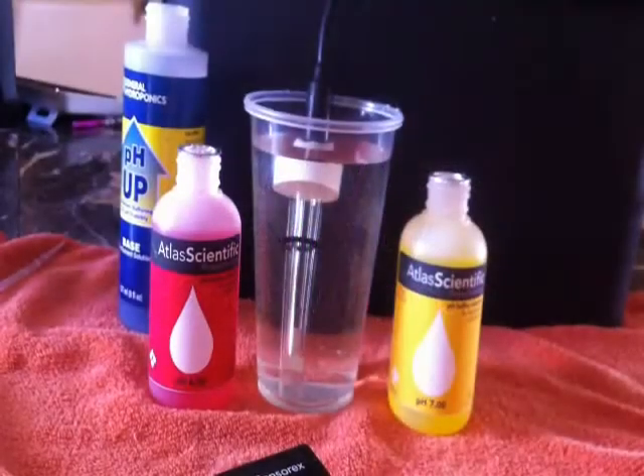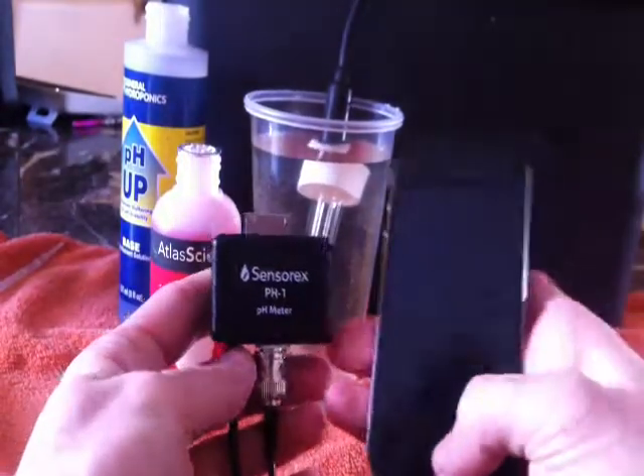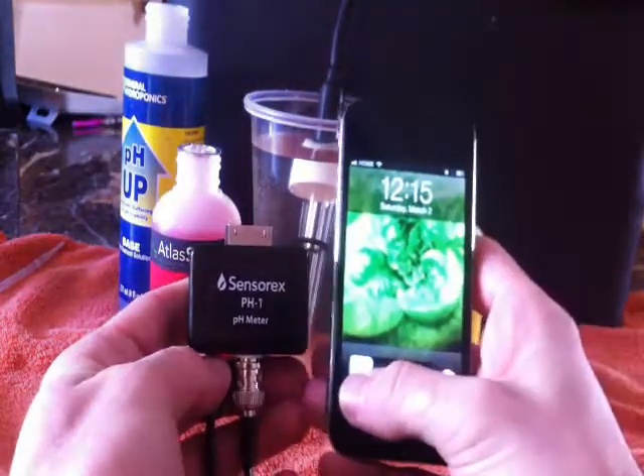Today we're going to review the pH 1 meter by SensorX. This is an iPhone, iPad, or iPod pH meter that plugs right in the bottom of your phone.